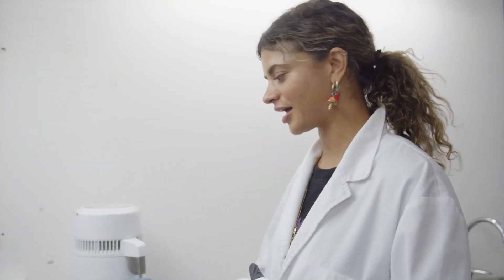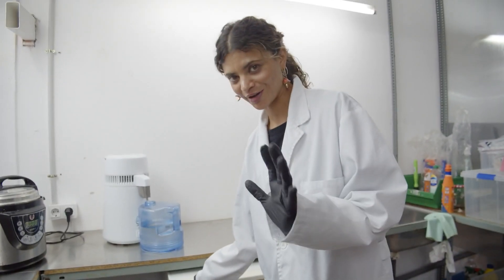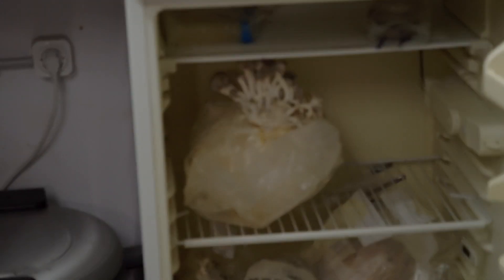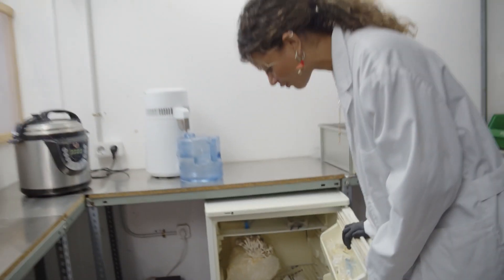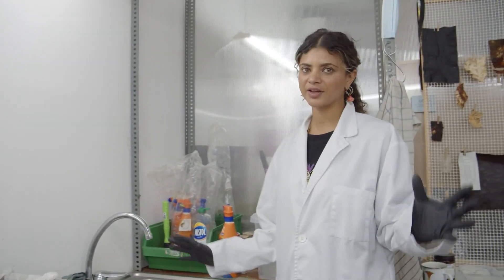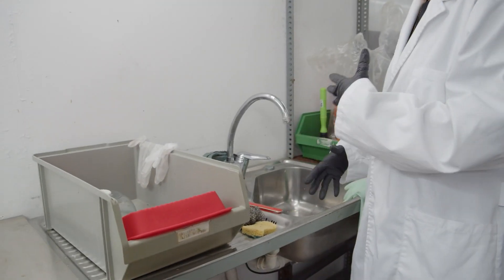On sustainability in the lab, we use a lot of distilled water, so we found it more useful to buy a water distiller. We also have a separate fridge — separate from a food fridge — where we store our cultures and some substrate bags, especially during summer when it's very hot, to keep our cultures alive. We tend to keep them in the fridge when we're on holidays.